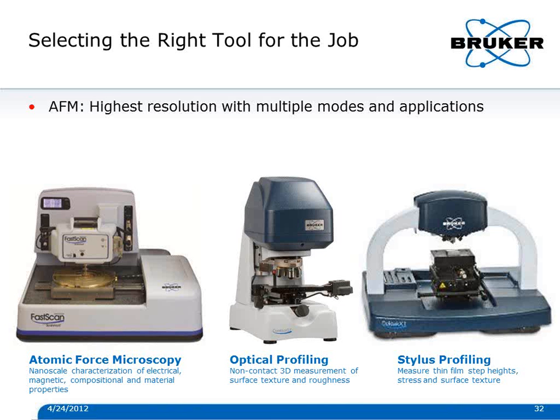But the limitation of the atomic force microscope is that it doesn't give you very much Z range and doesn't give you a very large XY range. So you typically can't measure an area more than 100 microns by 100 microns, or over 10 microns high. So although this gives you very, very high resolution, you have to limit your Z and your X and Y range for your measurement.